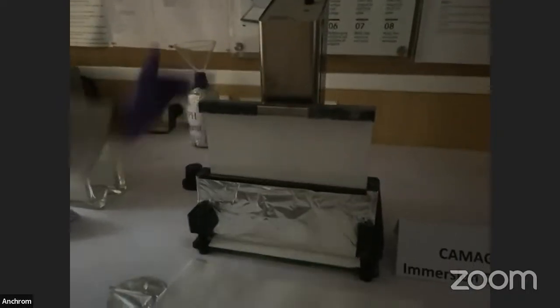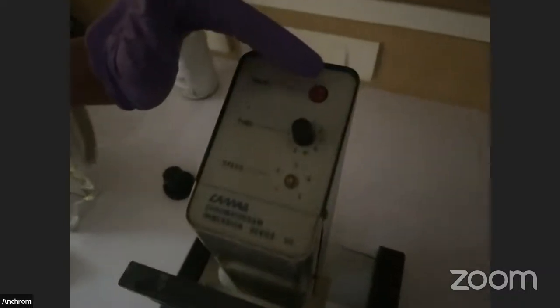Once your plate is hung onto this immersion device, now we'll click on the start button.